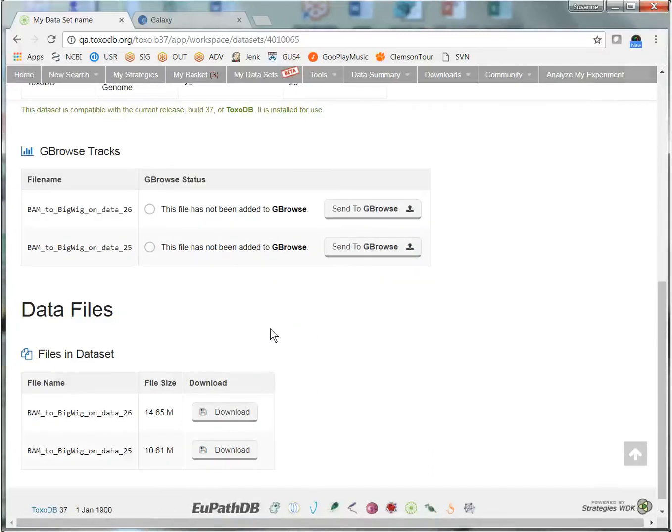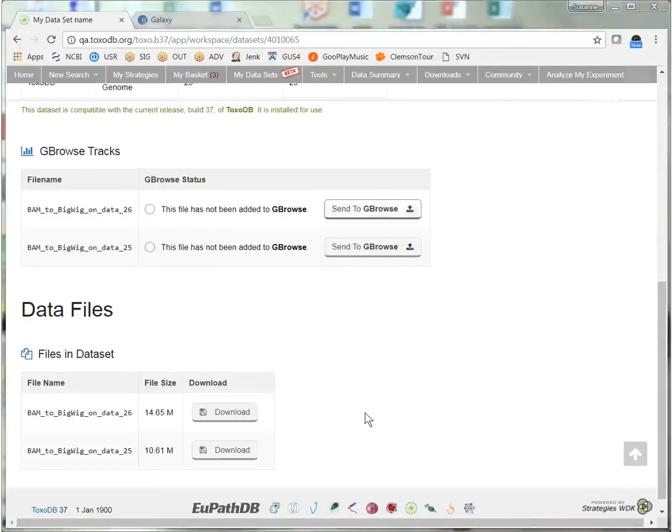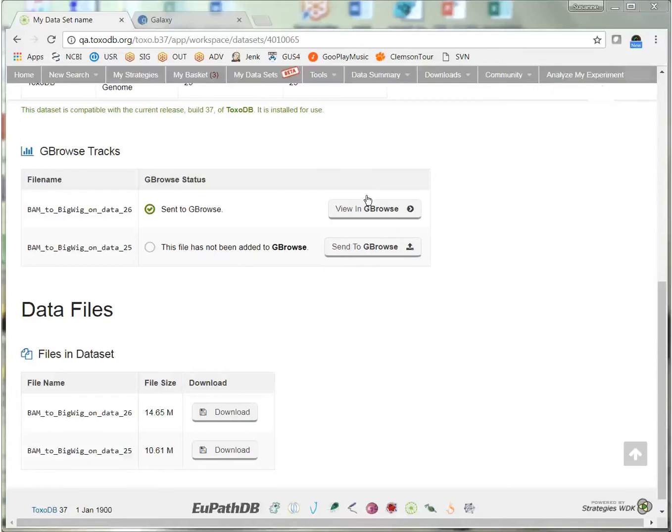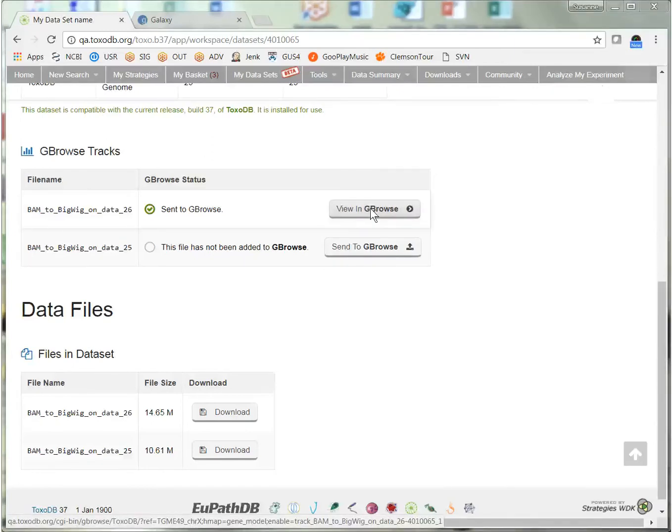The files are in the ToxoDB database, but not yet installed in GBrowse, so we need to click Send to GBrowse. And when the file is installed, the button changes to View in GBrowse. So we can click this to go to GBrowse and view the file.